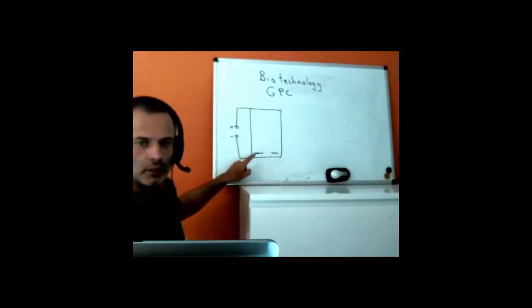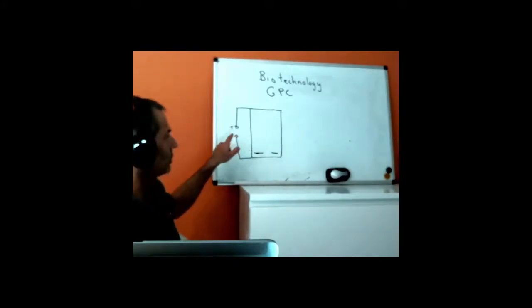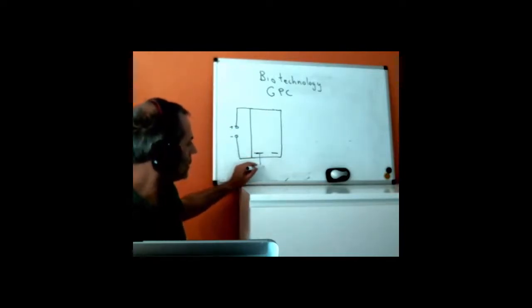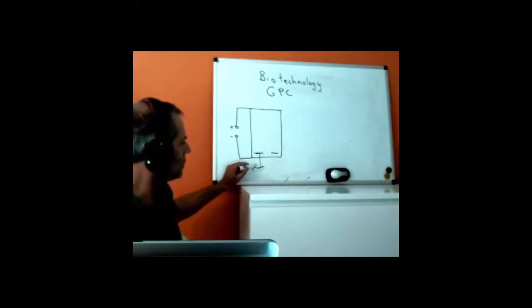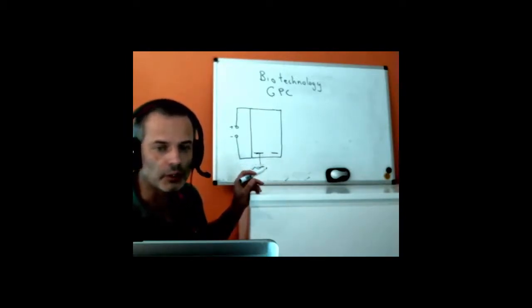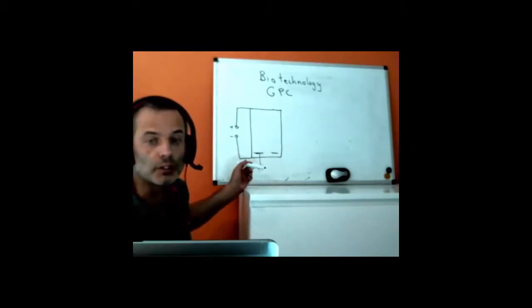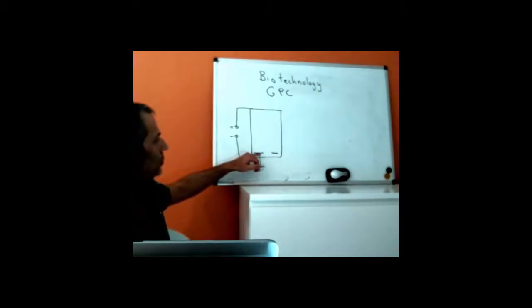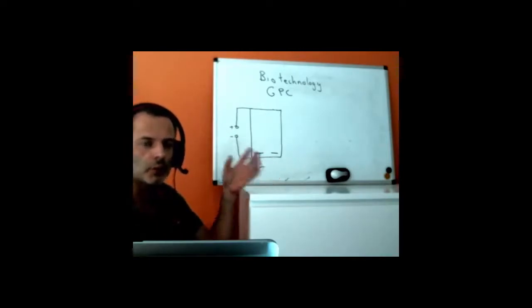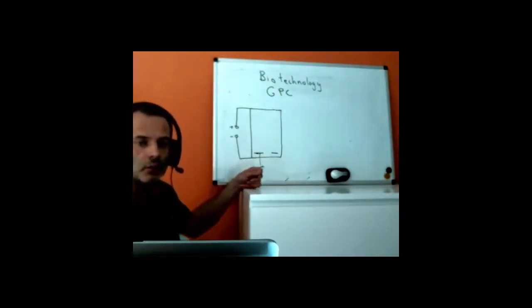So what do we do? We take a gel block. It's full of water. Let's think about what else will be in there in a moment. We're going to apply a voltage to it because our DNA, remember, was negatively charged. It's got a chain and it's got negatively charged parts on it. Now we'll discover something. All the DNA has the same negative charge per unit length, so there's a problem there. We can't tell the difference between differently charged groups because they're all charged the same. So our DNA is now going to move under the field through a gel. Because the gel is effectively a very viscous medium and it's full of particles that the DNA has to get past, the longer parts will go slower than the short parts.